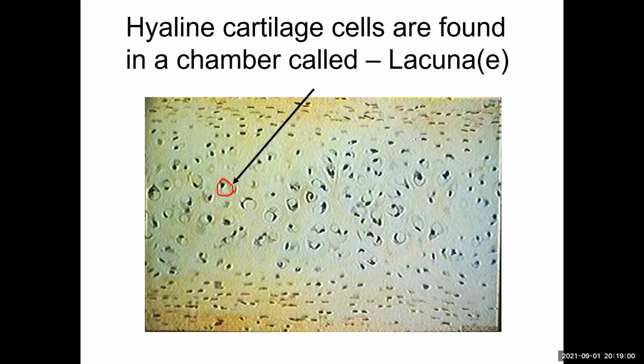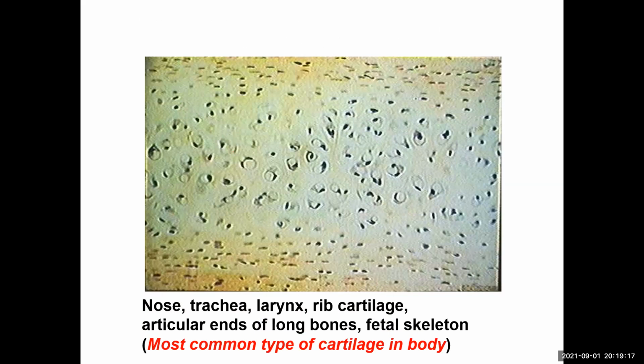I'll see this question so many times. It'll be pointing something like this, and it'll say space, and then somebody will be like chondrocyte. And I'm like, good try, but it didn't want chondrocyte. It wanted the name of the space that the chondrocyte lives in, and that's going to be the lacuna.